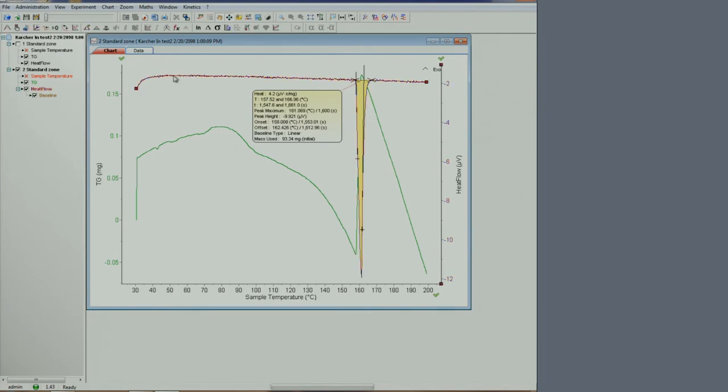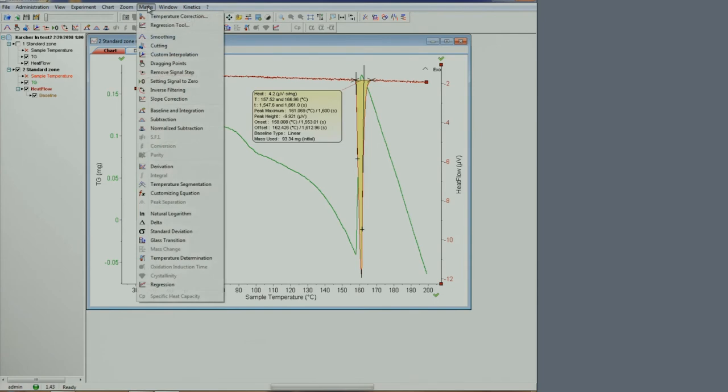Highlighting it will change the color. At this point, you can access a range of analysis options, for example, baseline and integration will integrate the peak area.